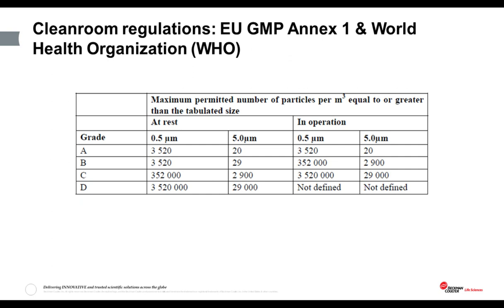And this in itself can present an area of potential error for our users, because in order to reduce the amount of time taken in routine environmental monitoring programs each day, the sample taken at each location is typically reduced to just 1-minute samples. Now, with a particle counter that captures 1 cubic foot of air per minute, it means that the sample volume is just 1 cubic foot because it's 1-minute sampling.